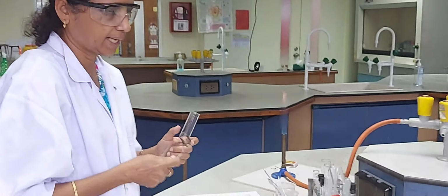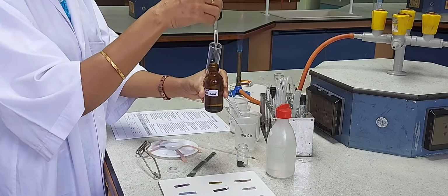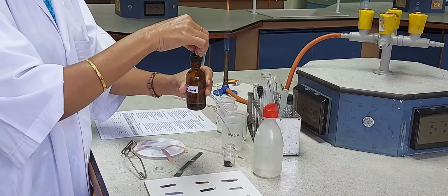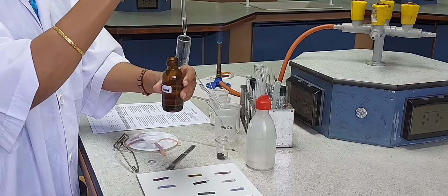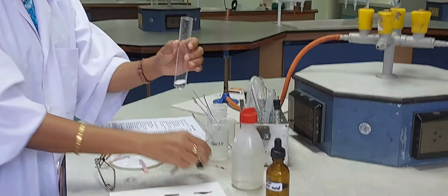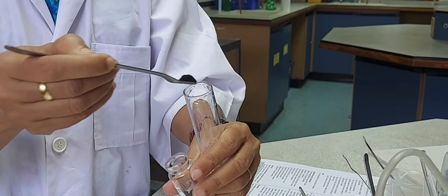And let's dissolve copper oxide in acid and check for its reaction. So I'm taking dilute hydrochloric acid again, and add copper oxide, a quarter spatula.